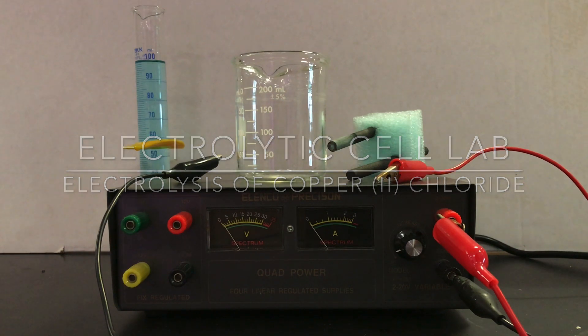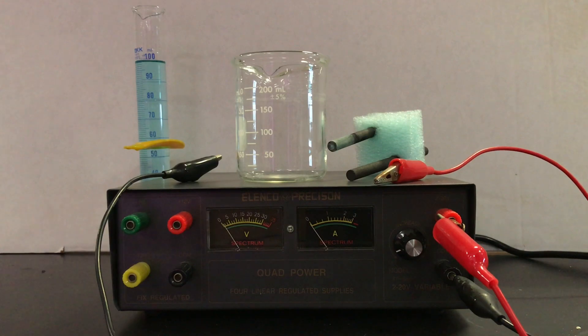This is the electrolytic cell lab. Objective number one: to identify all parts of the electrolytic cell, including the charge flow of electrons in the voltaic cell or DC power source and in the electrolytic cell itself. Objective number two: to determine the experimental mass of copper that will be collected at one of the electrodes, and to determine the experimental molarity of the solution assuming the reaction goes to completion. Number three: to determine the accuracy of results using percent error and calculations to determine how many grams of copper should be made.